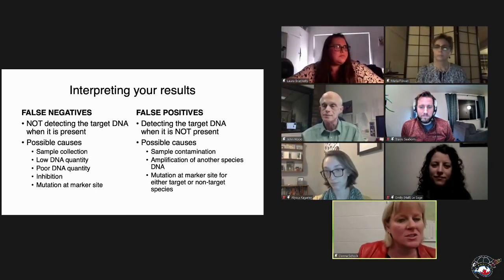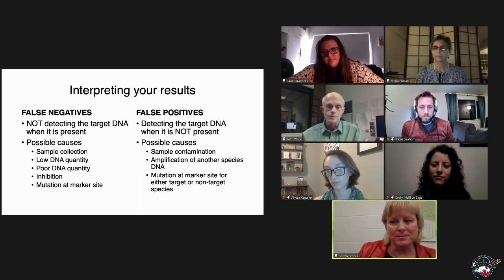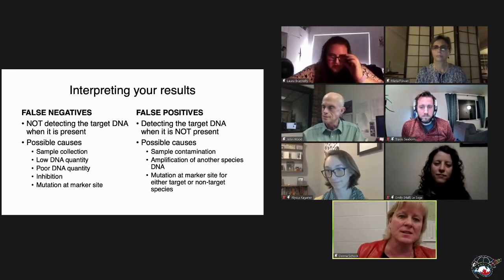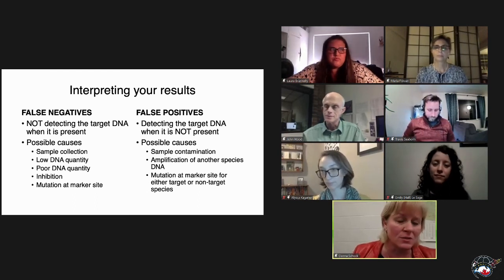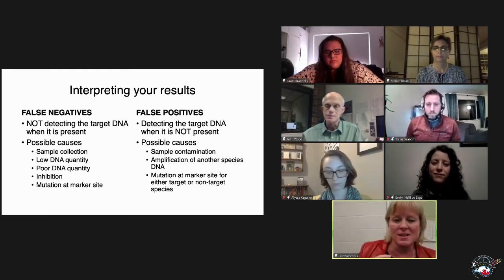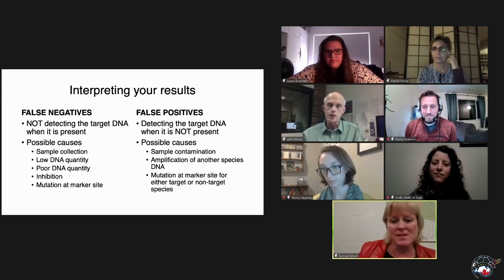One thing that you mentioned, John, the use of that IPC, that internal positive control. Some of the things that I've encountered is that this step is not included in a lot of studies. I'm not sure if it's cost cutting or if people are just assuming that, well, they've diluted their water sample and therefore they don't need it. But I heard you just now say that you always use an IPC, and I'm seeing a nod from the panel. So you guys are all agreeing. No IPC, you're running the risk of not knowing what's going on.